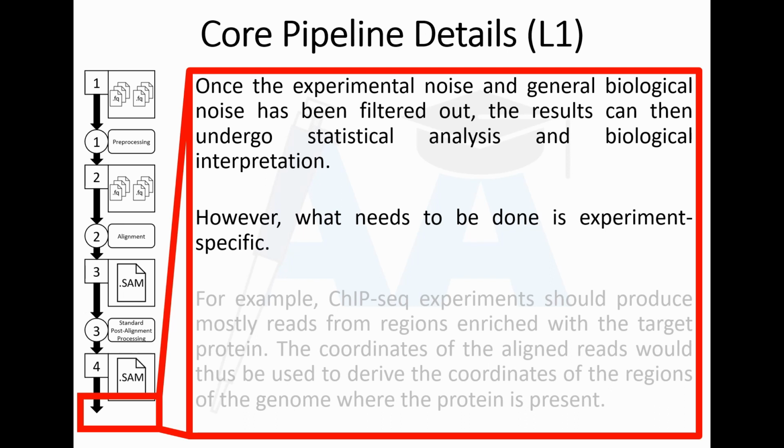In contrast, ChIP-seq experiments use NGS to sequence genomic DNA, which was extracted from a pull-down assay, targeting a protein of interest. This allows us to deduce which parts of the genome the target protein is more likely to associate with. Very different. These are just two examples of the many experiments which can be done using NGS technology. But I digress.